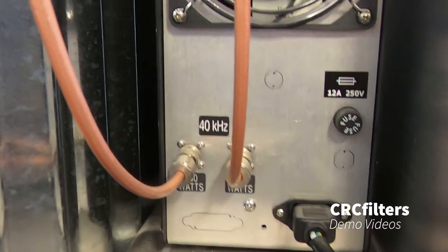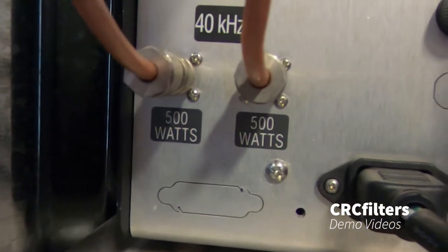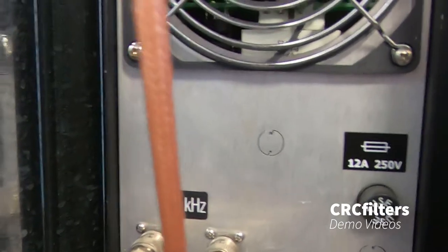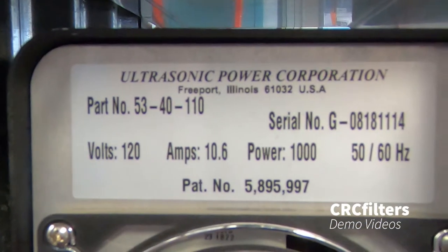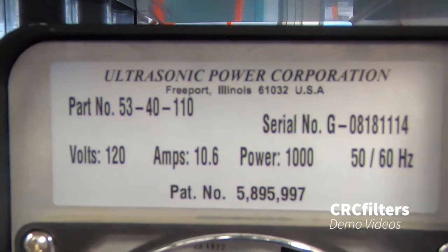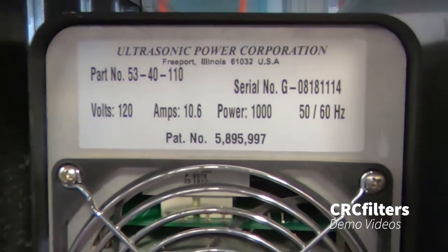This is the back of the generator and you can see each line is 500 watts. We've got 500 watts worth of transducers in each column. Here is the tag if you want to buy the exact unit to operate the system — it works really well and these guys provide pretty good customer service. We've had really good experiences with this company.